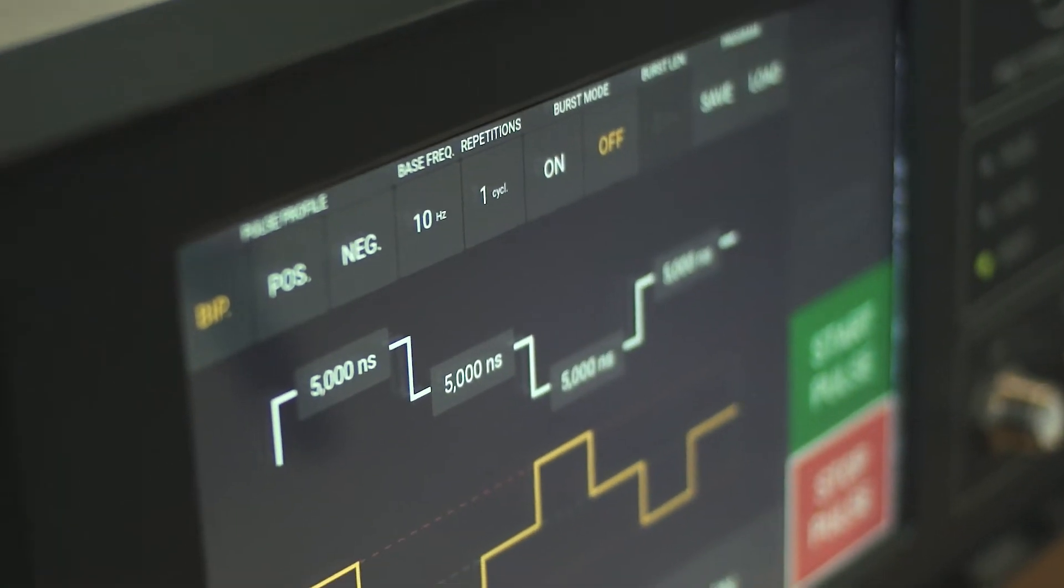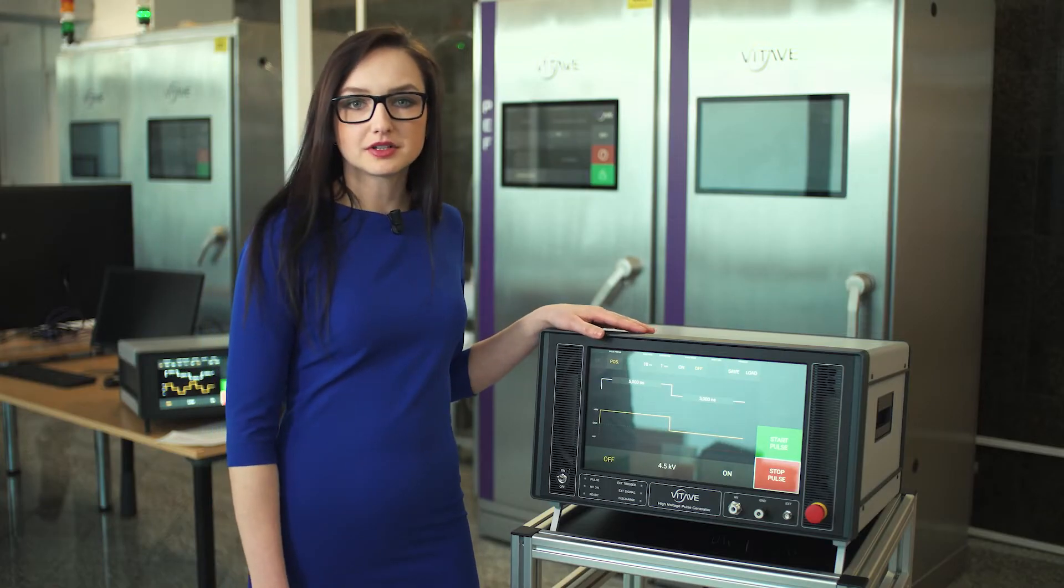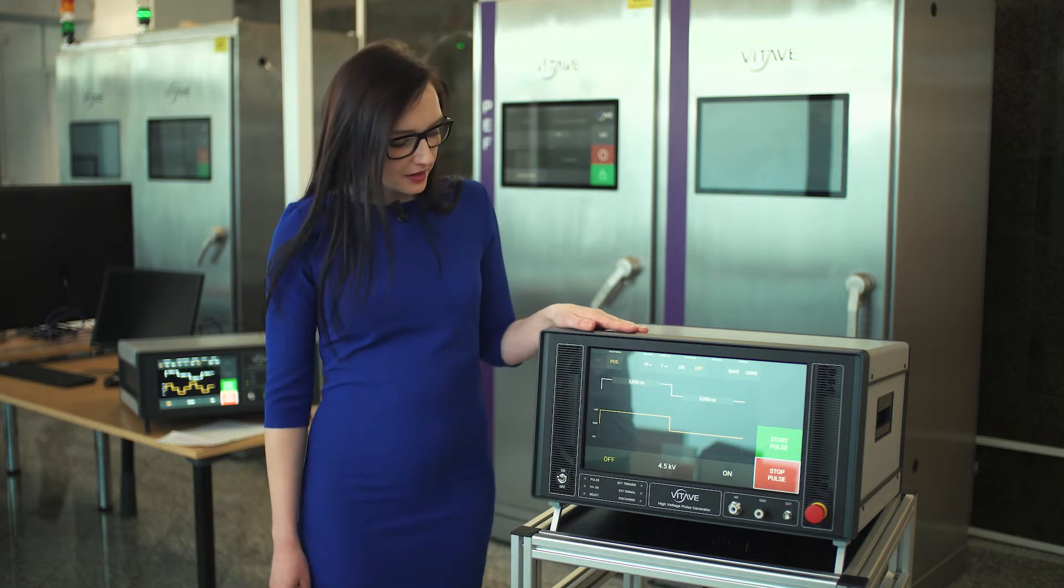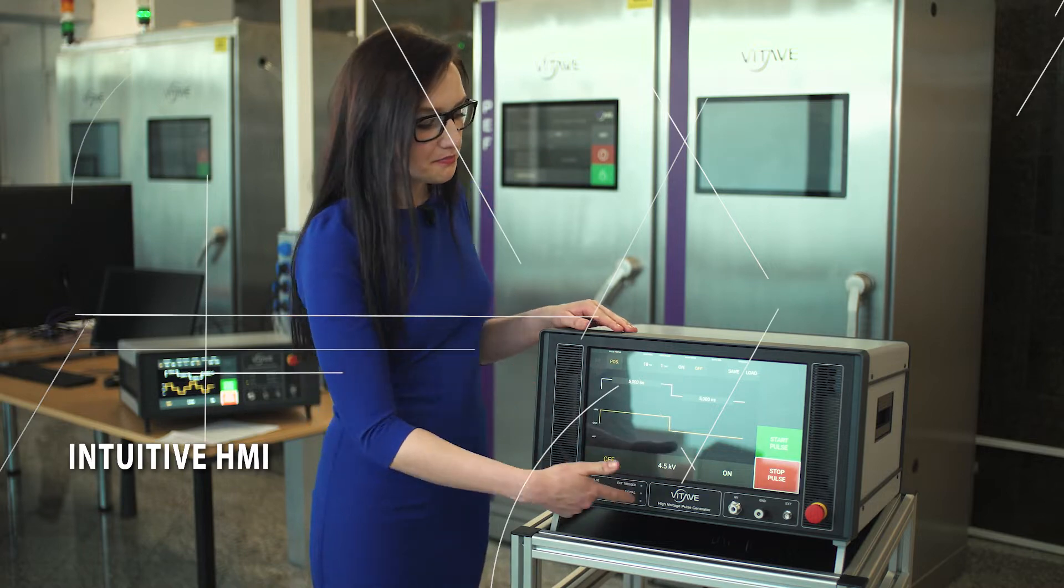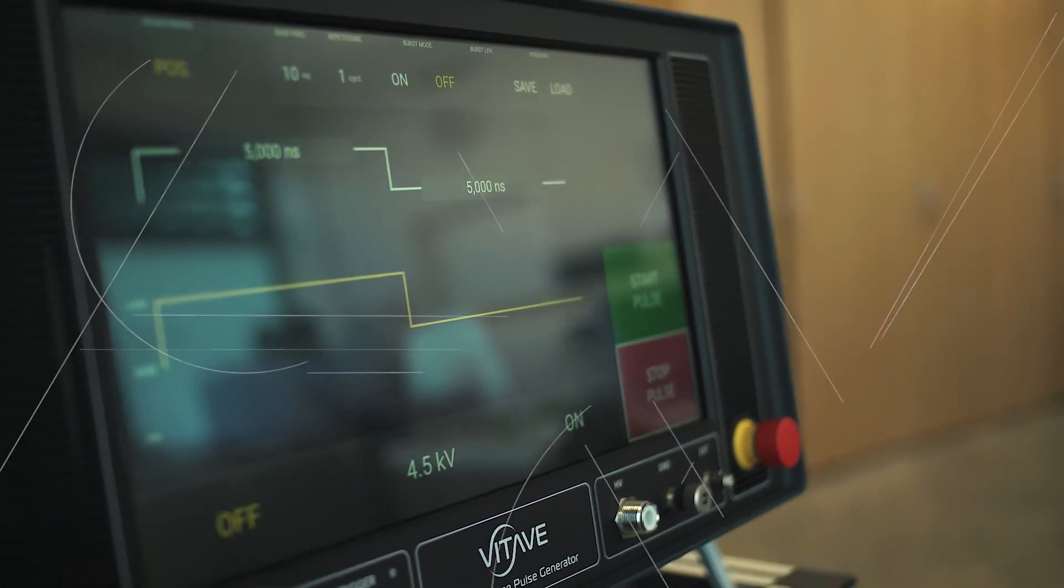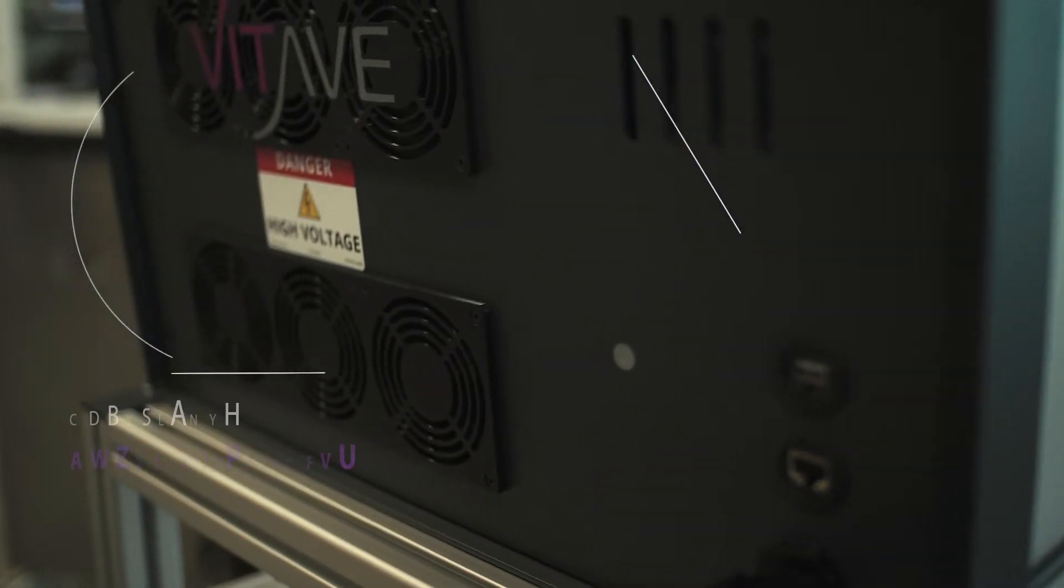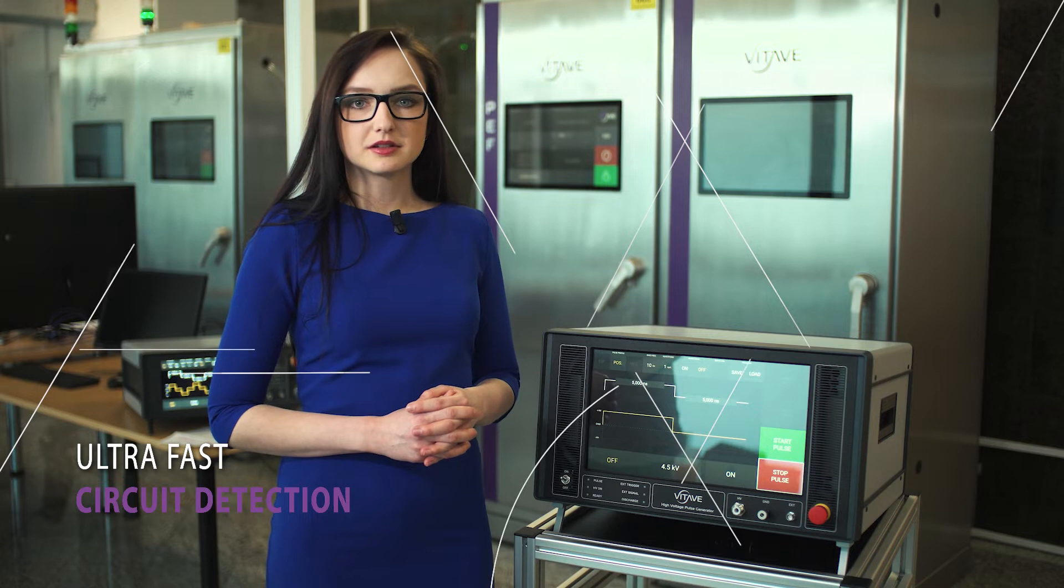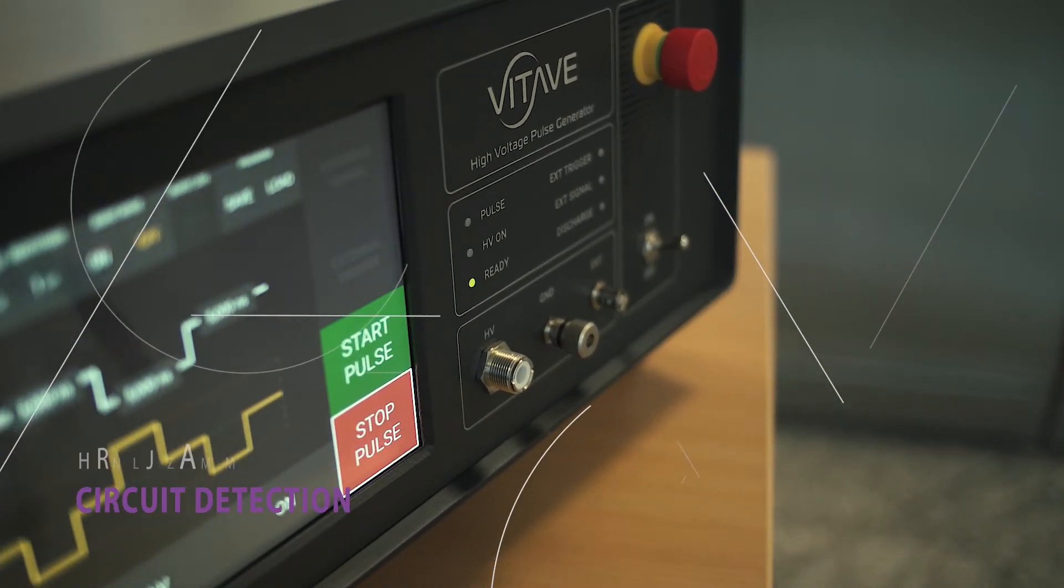Viteve's high voltage pulse generators come in compact size suitable for desktop application with intuitive human machine interface, a big touch screen, and integrated power supply unit allowing easy high voltage power generation out of the box. Each pulse generator comes with ultra-fast short circuit detection which ensures safety for users and equipment.